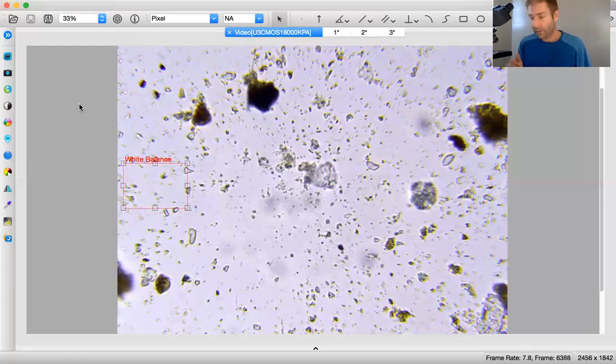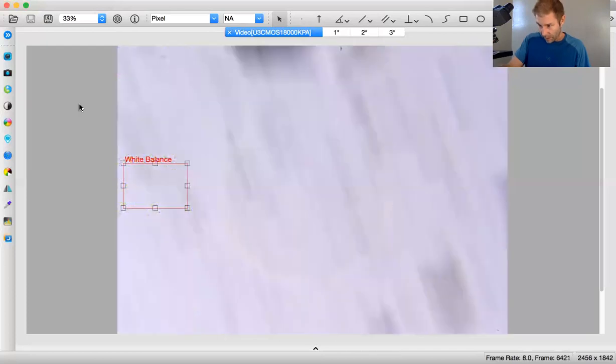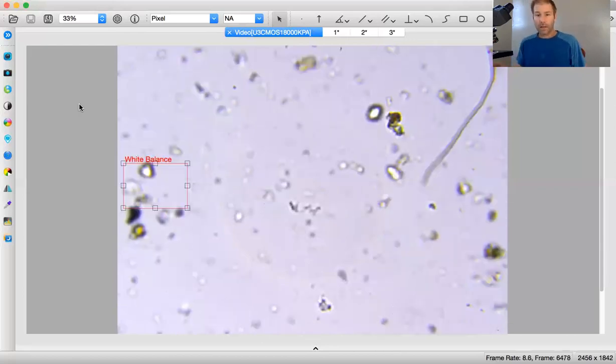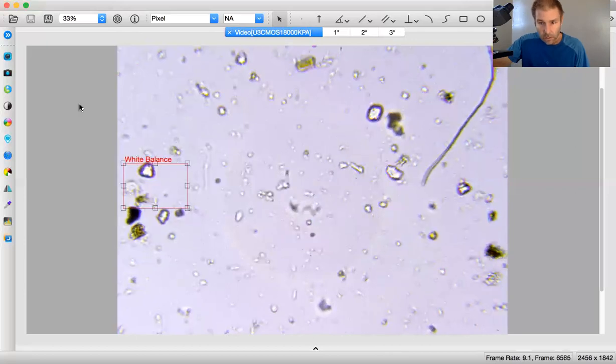So let us begin. I'm moving to the top left now of the first swimming lane. And it appears we have some fungi. Excellent. Everything, I need to get it in focus, obviously. So that is definitely fungi.